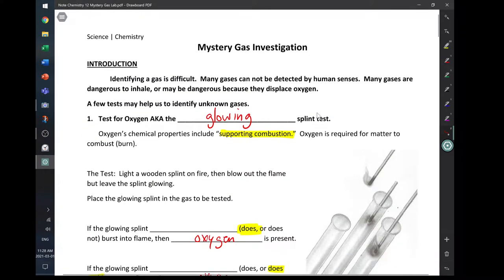Welcome chemistry students to the mystery gas investigation. In this lesson we're going to use some chemical properties to identify different gases. Identifying gases is very difficult. Many gases cannot be detected by human senses and many gases are dangerous to inhale or may be dangerous because they displace oxygen.